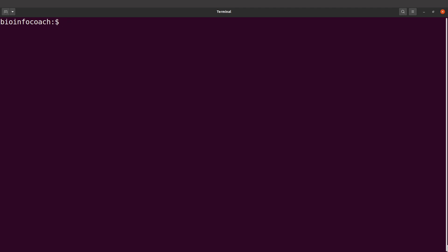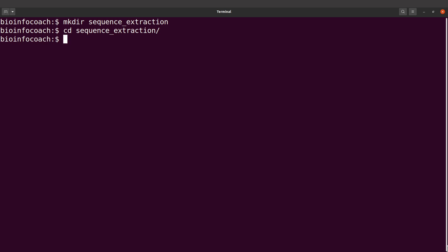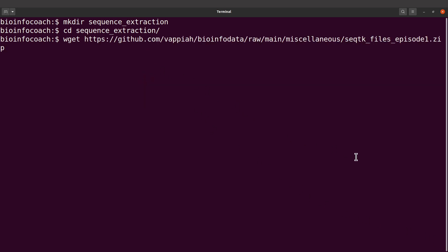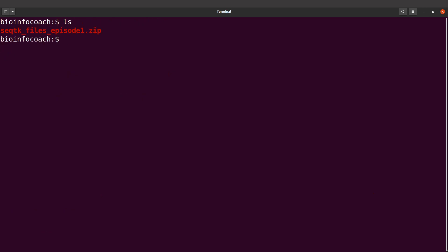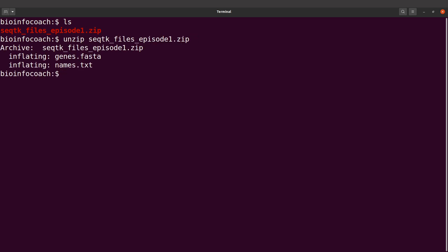On the terminal, I will create a directory that will be my working directory. I'll use mkdir and name it "sequence_extraction", then cd into it. Now I'm going to download the example data using wget — I'll supply it with the download link and execute the command. The data has been downloaded. Let's clear the screen, do an ls, and we find the file. I'll use unzip and specify the filename to extract the content. After doing ls again, we find the extracted files.